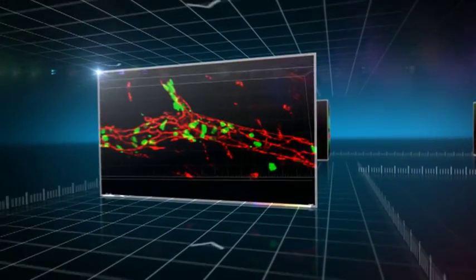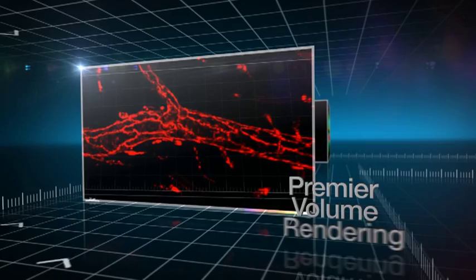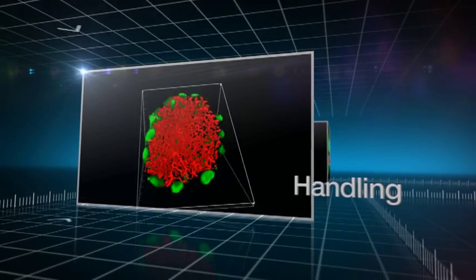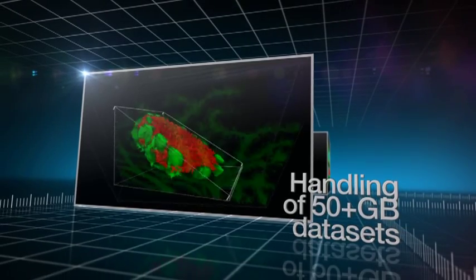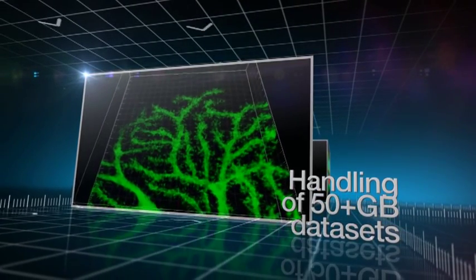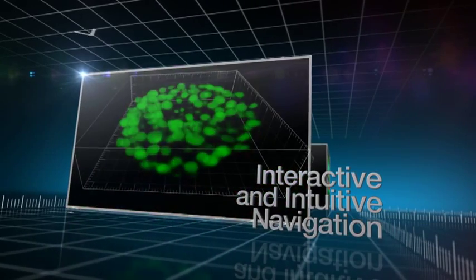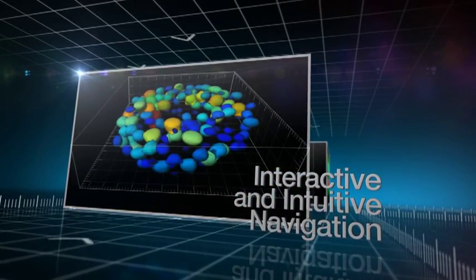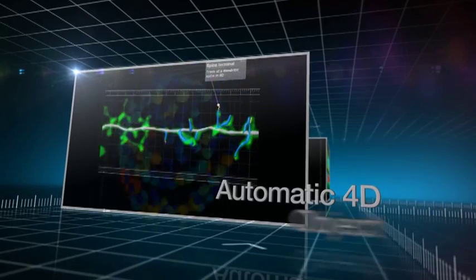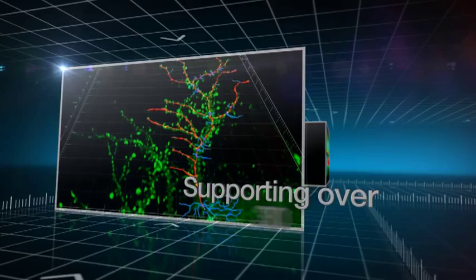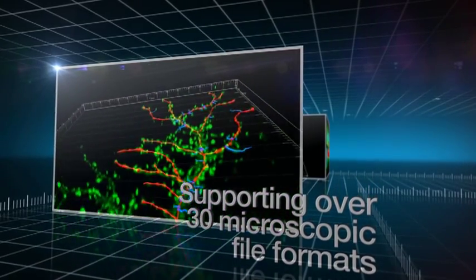Ever-changing applications and new microscopy imaging techniques produce multifaceted images that can be visualized, quantified and annotated with Imaris and its modules. Demanding applications like dendritic spine tracking in four dimensions, spine type classification, filament tracing and cellular component analysis can now be performed seamlessly between modules of Imaris to offer you unrivaled performance.